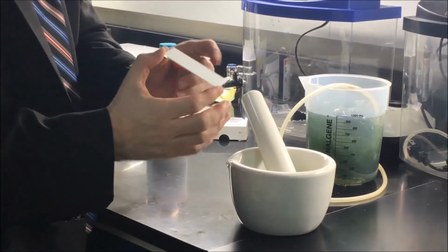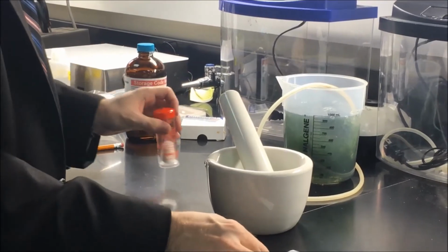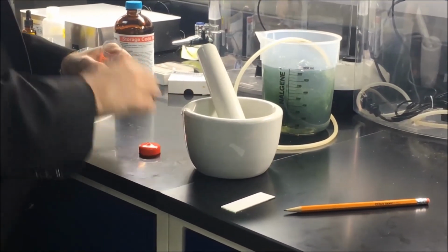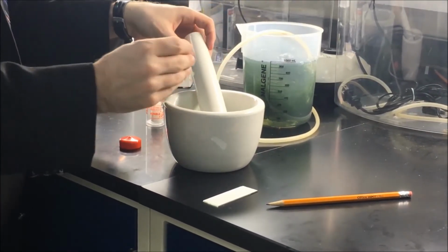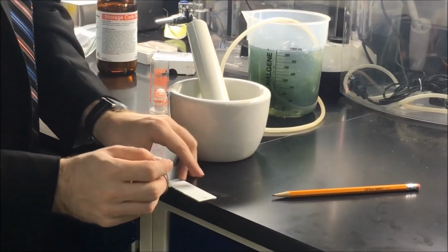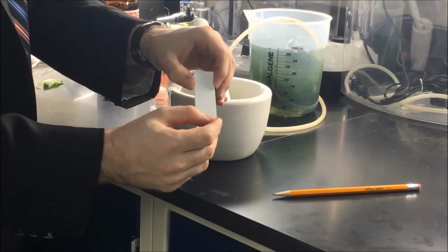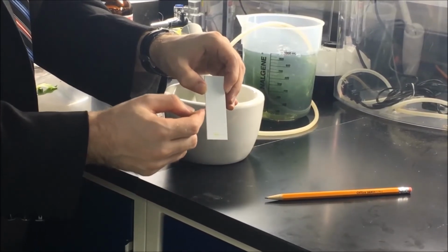I can then take a thin layer chromatography plate, as you see here, and spot it with that pigment. So I'll begin by drawing a line in pencil. And then taking a capillary tube, I'll dip into some of my liquid and then touch my plate like such. I'm going to allow that to dry, and then I'm going to spot it again, say 5 or 6 times, until I have a nice dark spot on my plate.